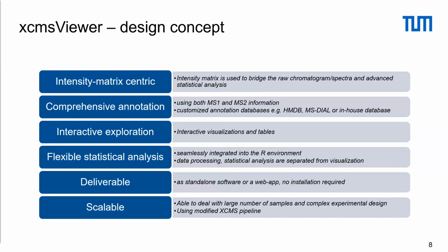Also, in XCMS Viewer, we have a comprehensive annotation of the data using both MS1 and MS2 information. Also, the database we use can be customized according to the needs of the project. And also, interactive exploration is a unique feature of XCMS Viewer.